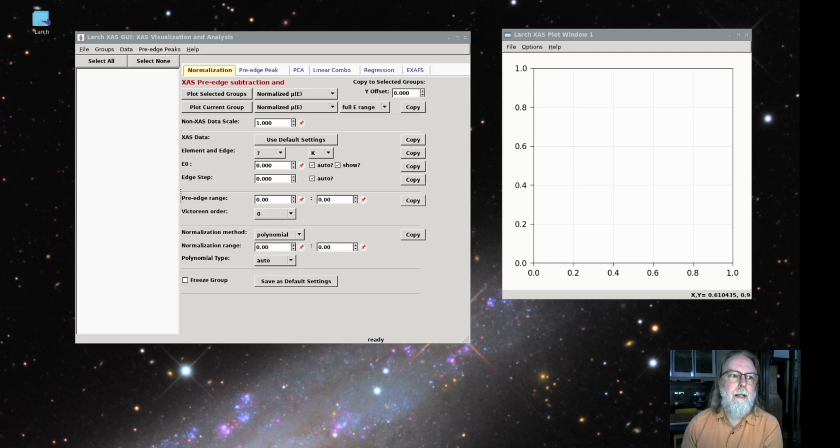The pre-edge peaks of the first row transition metal K-edges are particularly rich as they clearly display intensities that depend very strongly on bonding environment and symmetry to the oxygen ligands. These pre-edge peaks are below the continuum 4p level and so are partially bound to the metal atom, but display hybridization from the ligands, typically oxygen.